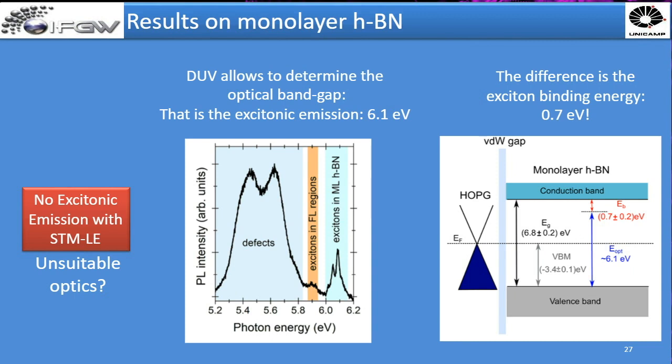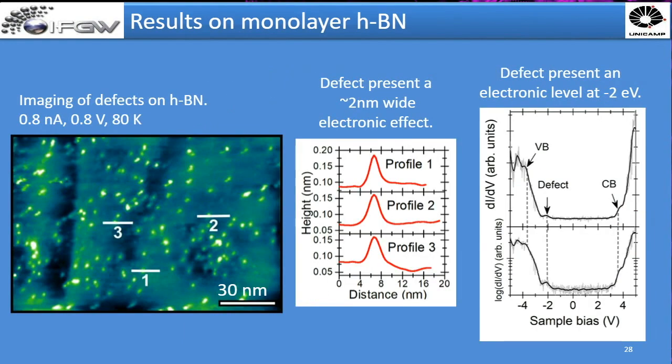And that's interesting because it's possible now to compare with models and to evolve the models that are also studying this material. But of course, a featureless sample is boring, so we tried to find some defective region. And of course, there is a huge source of carbon beneath the HBN, and we could expect that in some regions, at least, there should be some carbon-related defects.